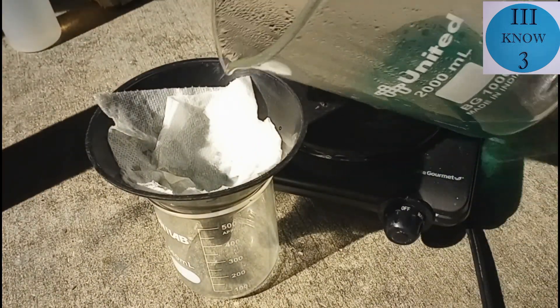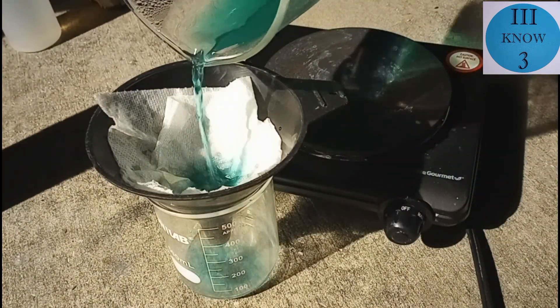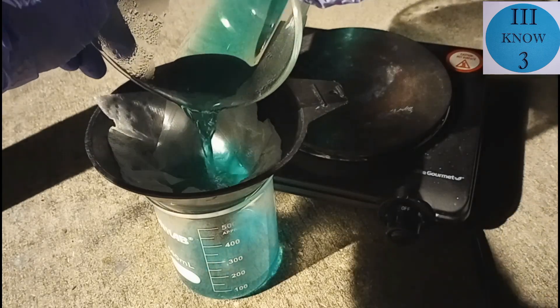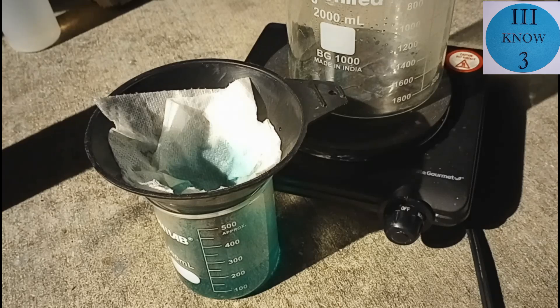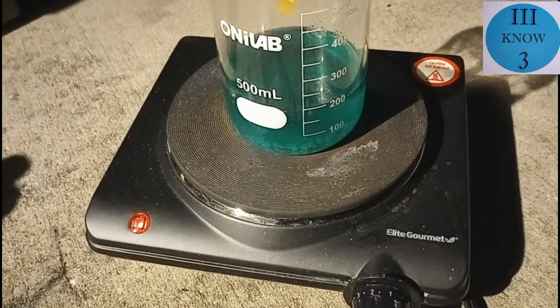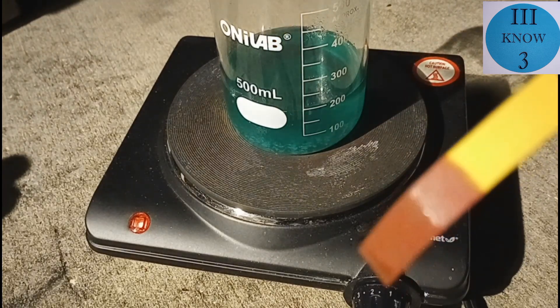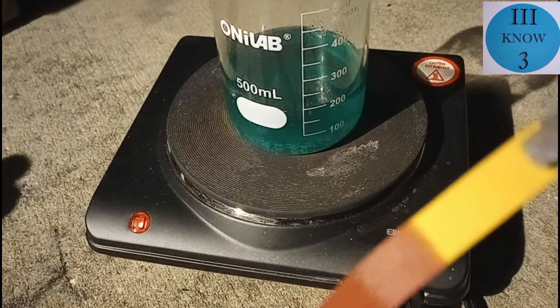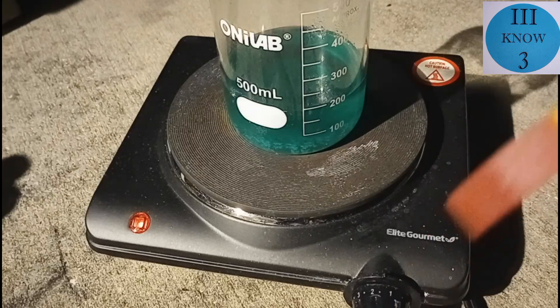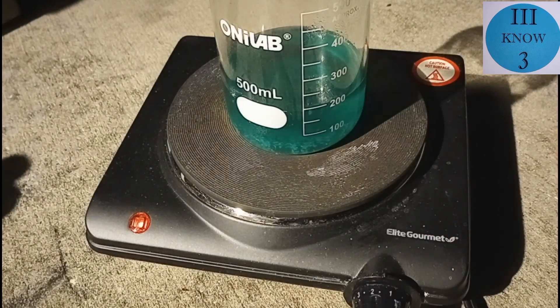We let it cool off and ran it through a filter just to see if there were any solids to filter out to get ready for the next step. Then we did a pH test to see if it was still acidic enough. We got a very quick, very dark red, which means it's probably pretty close to pH 1 — very acidic.